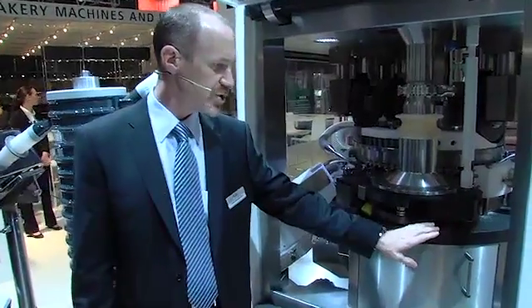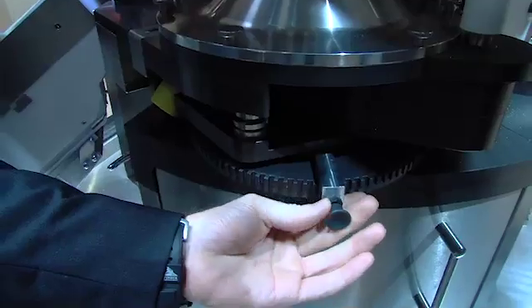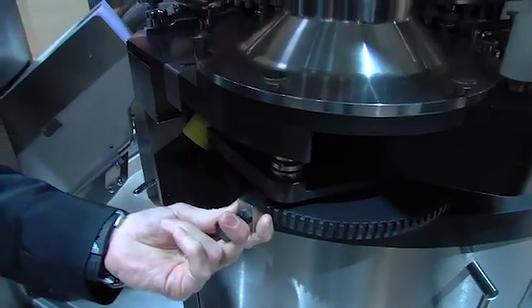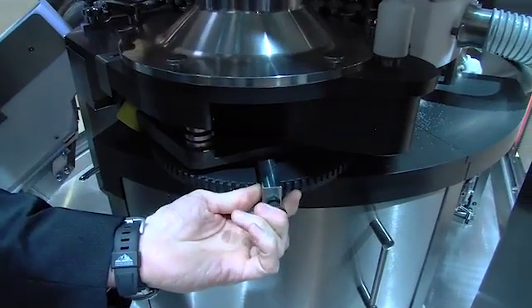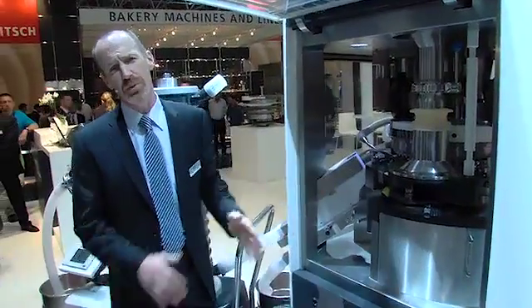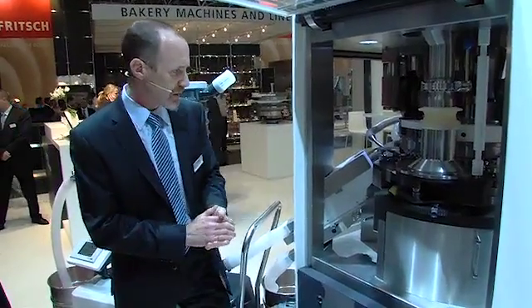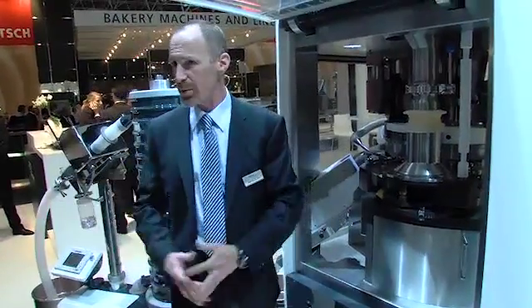The last design change on the new Fill-O-Matic is an ingenious system for easily lowering or raising the actual feeder assembly from the base table on which it is installed. This is a very effective and easy way for improving yields, maximizing yields, reducing product loss, and something that will be very easily embraced by setup mechanics and operators.